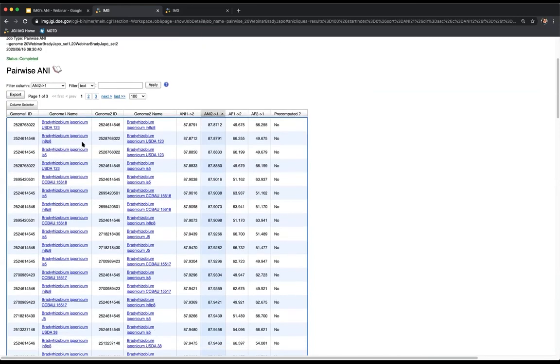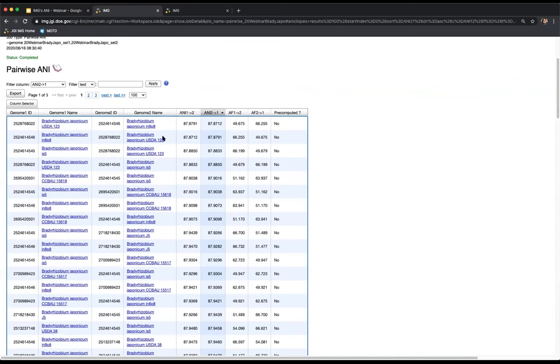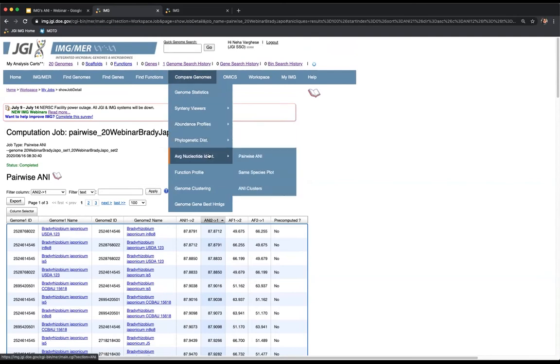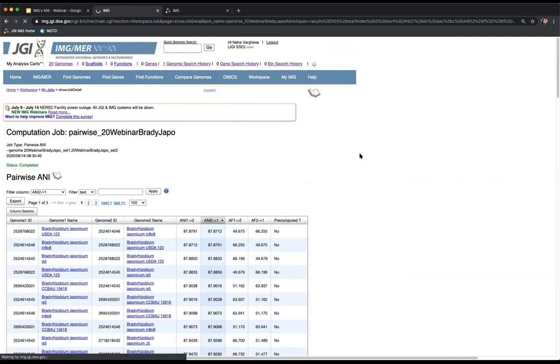Based on the pairwise ANI table, there are several pairs that have questionable ANI and questionable AF. One thing we can explore is whether this issue extends to other species in the same genus — are there other Bradyrhizobium species with questionable ANI-AF within the species? To do so, we're going to look at the Same Species Plot. Go to Compare Genomes, Average Nucleotide Identity, and the second option — Same Species Plot.